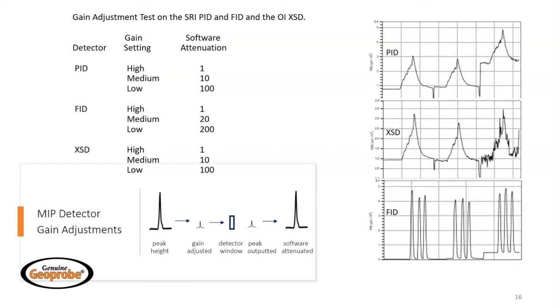As the gain level increases, we do see a baseline shift or a little bit of increased noise with the current concentrations being sampled in this test. But if it's needed in the field, it won't be noticeable as the concentrations are going to be significantly higher.